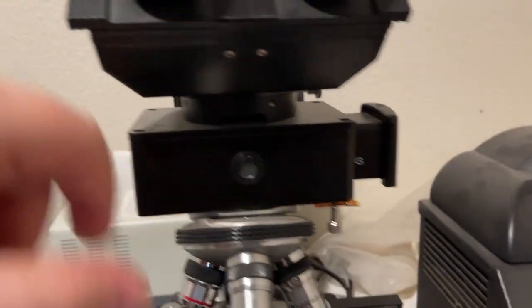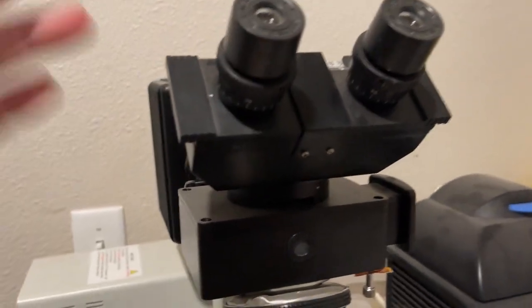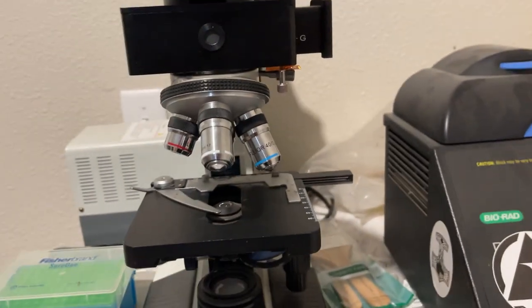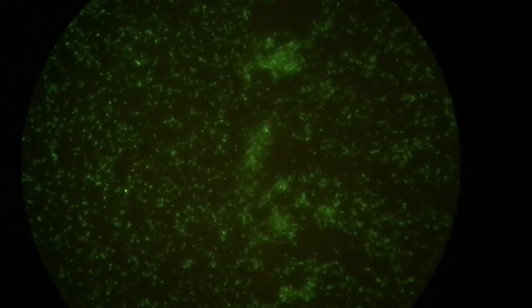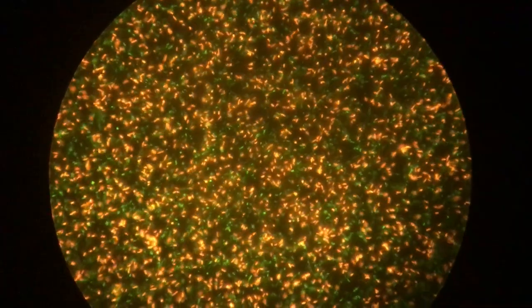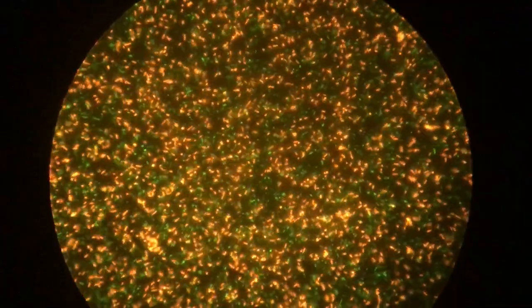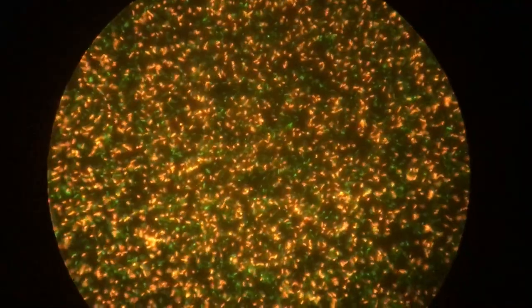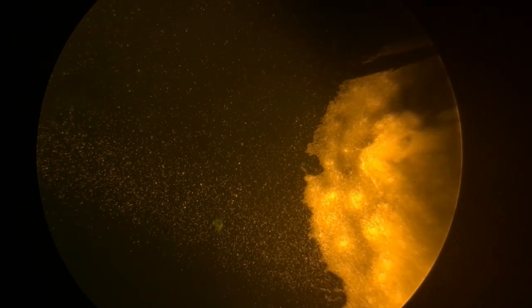Split for the two eyepieces, and then you can see it. I'll put in a picture of what it looks like, because it's actually really gorgeous. I can just get lost looking at even things like just genetically modified E. coli under the fluorescent microscope. A very nice piece of equipment, very elegant piece of machinery, but it's got a problem.